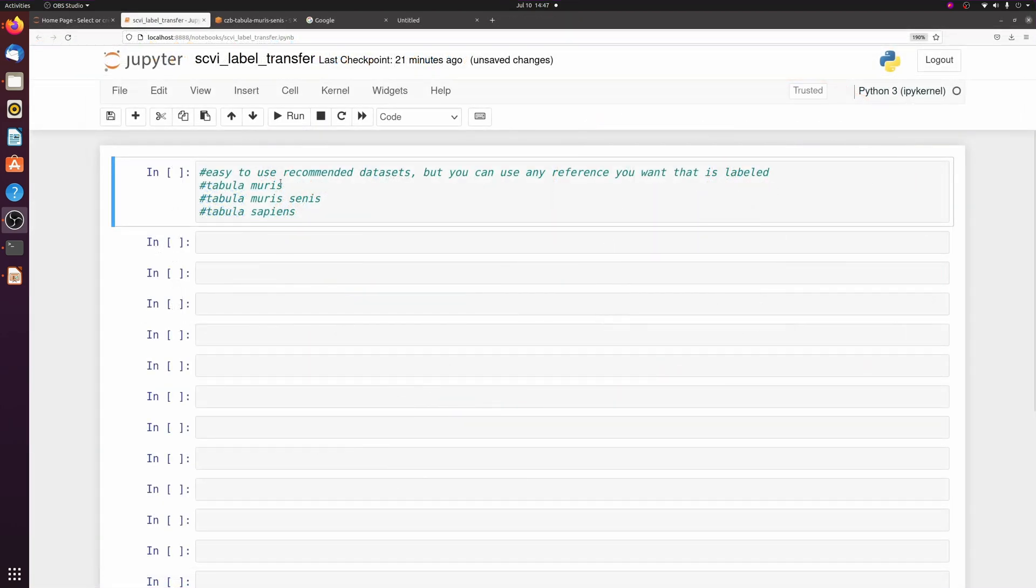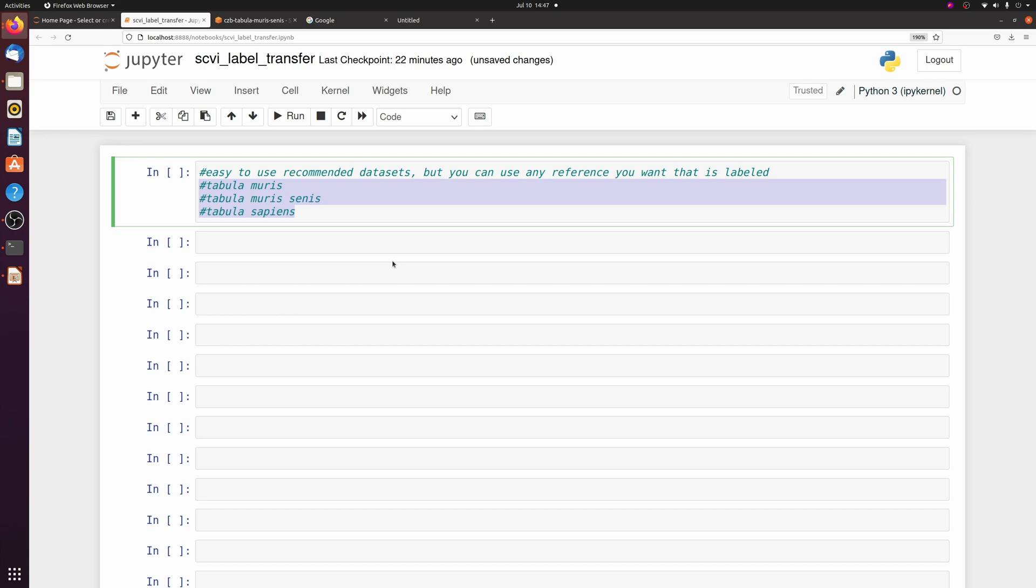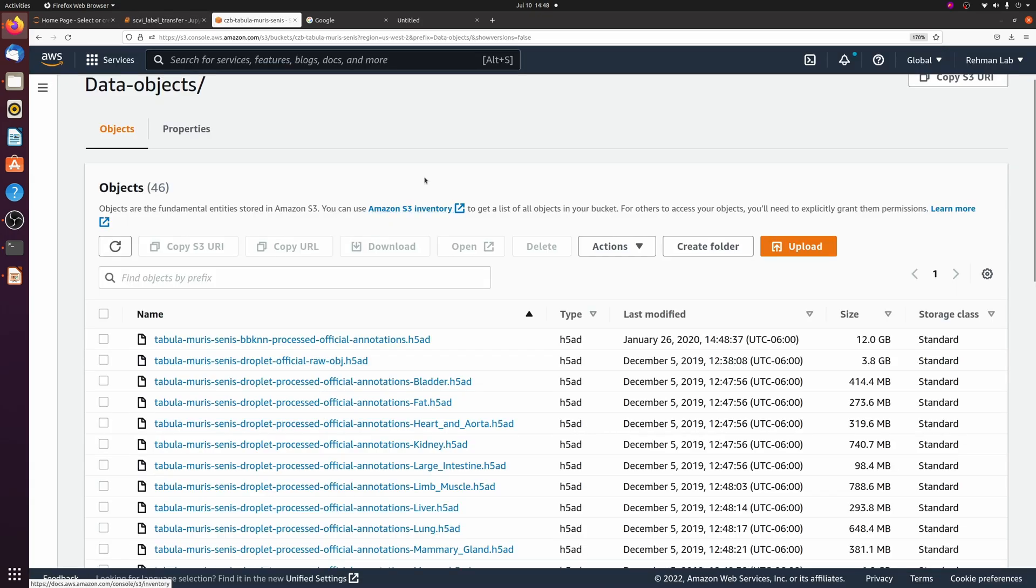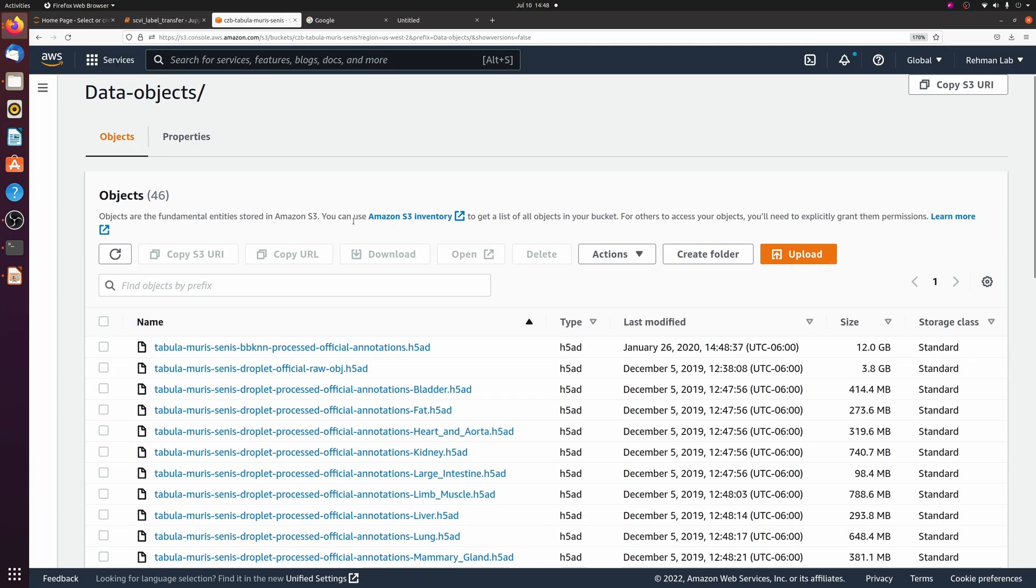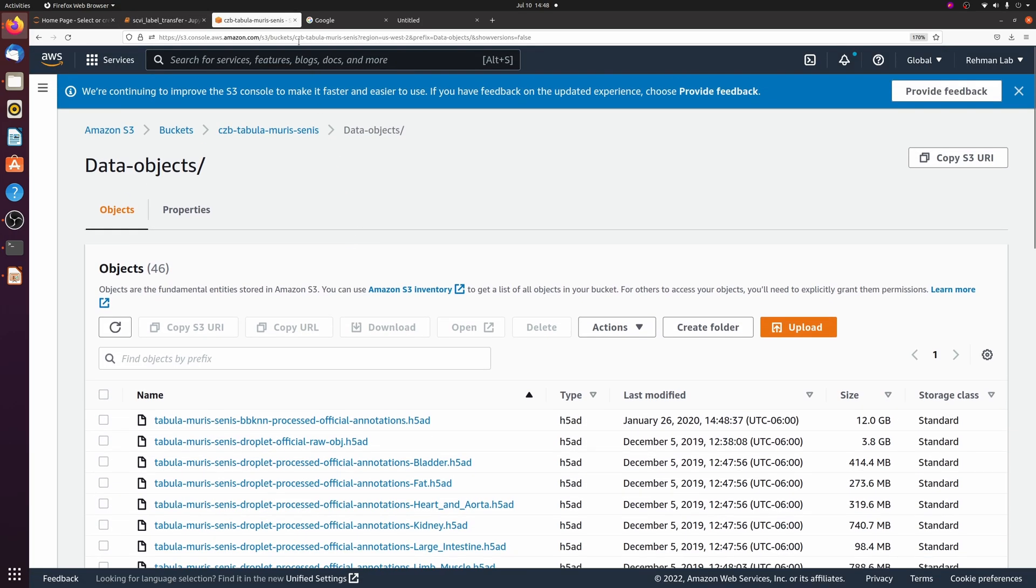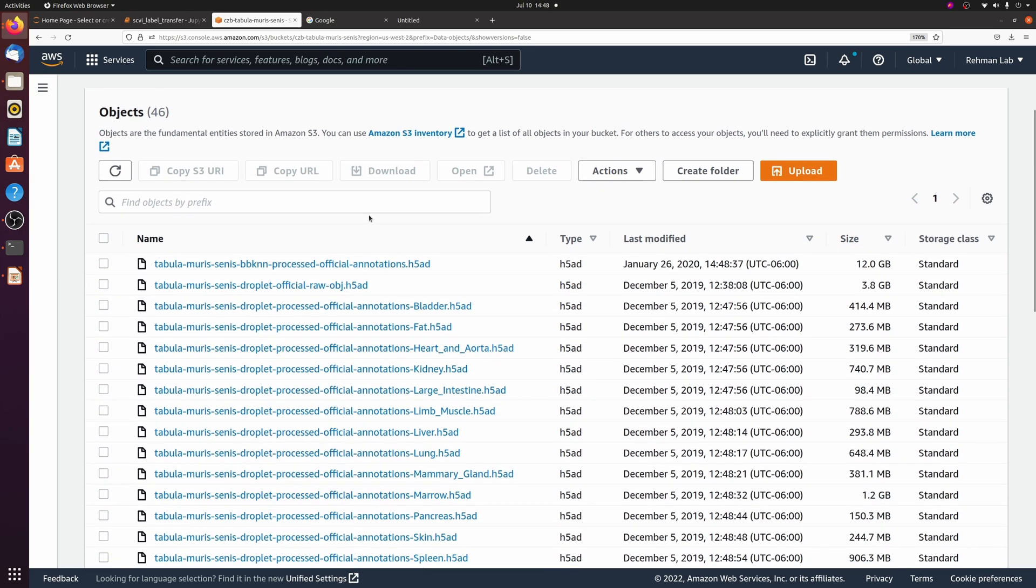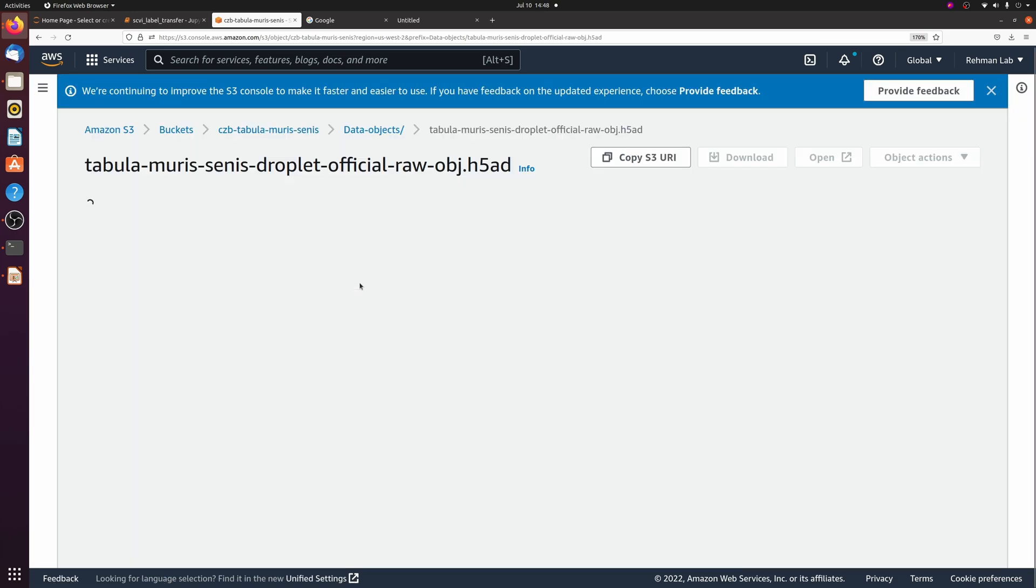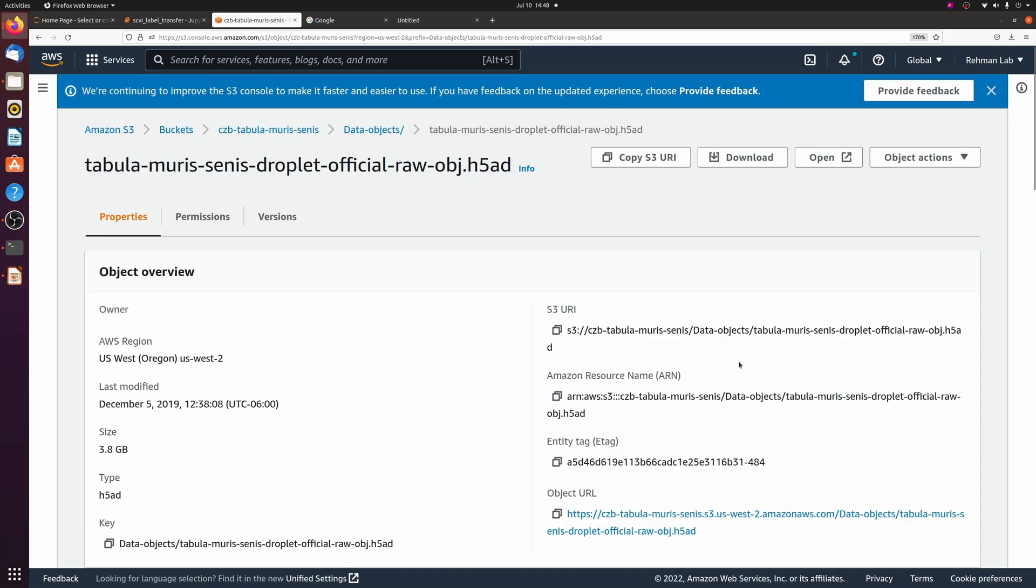So the first thing we need to do is download the reference dataset. You can use any dataset that's already labeled, but I highly recommend these three datasets if you have mouse or human data. I'm going to be using Tabula Muris Senis just because I think the data is a little easier to access than Tabula Muris. The data is available even if you don't have an AWS account, but if you do have an AWS account you can search their bucket for specific datasets.